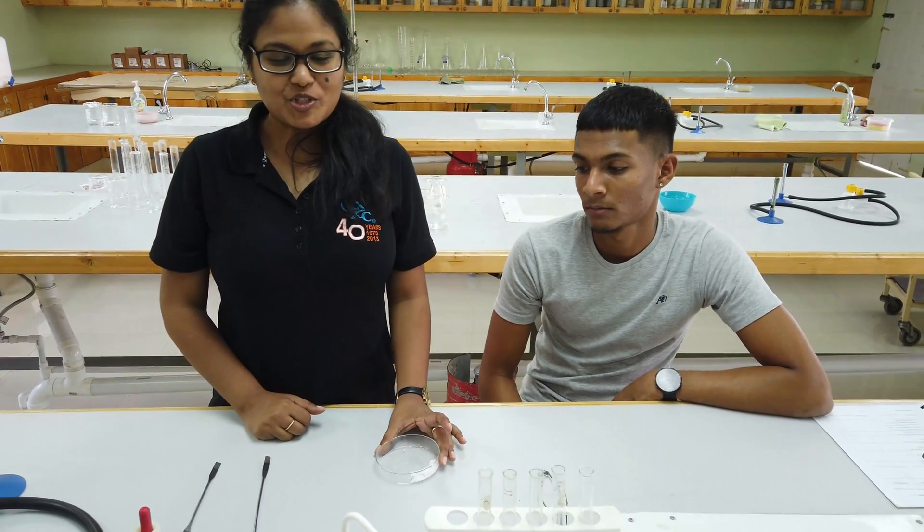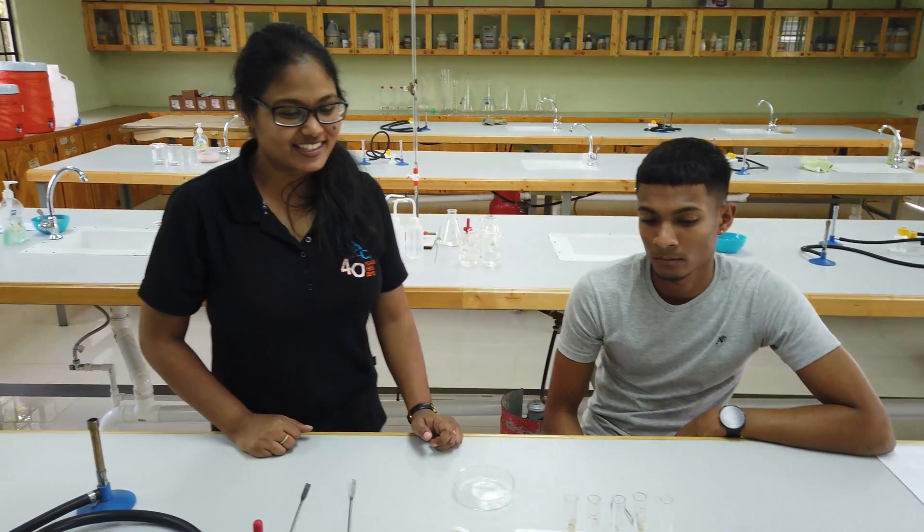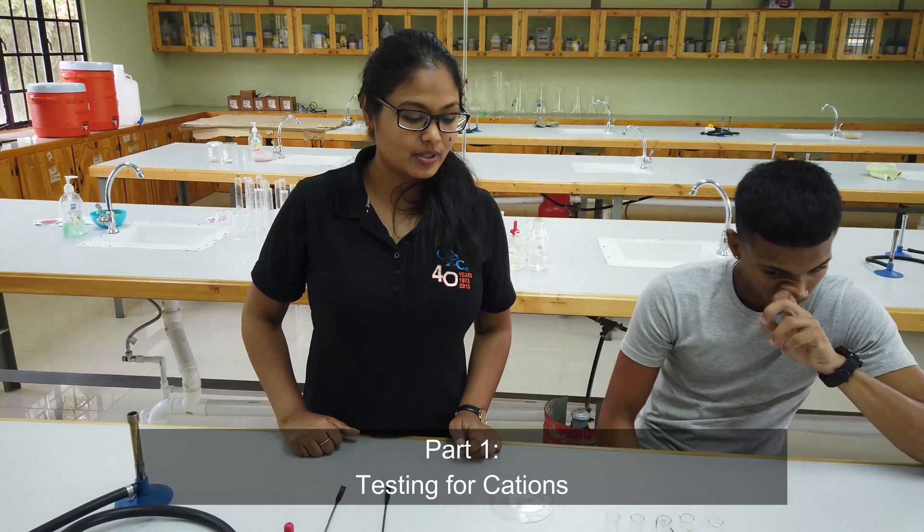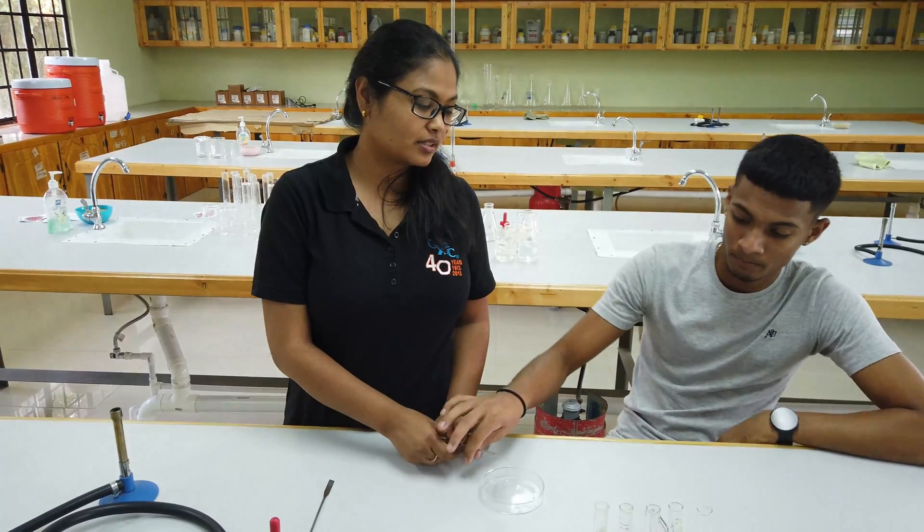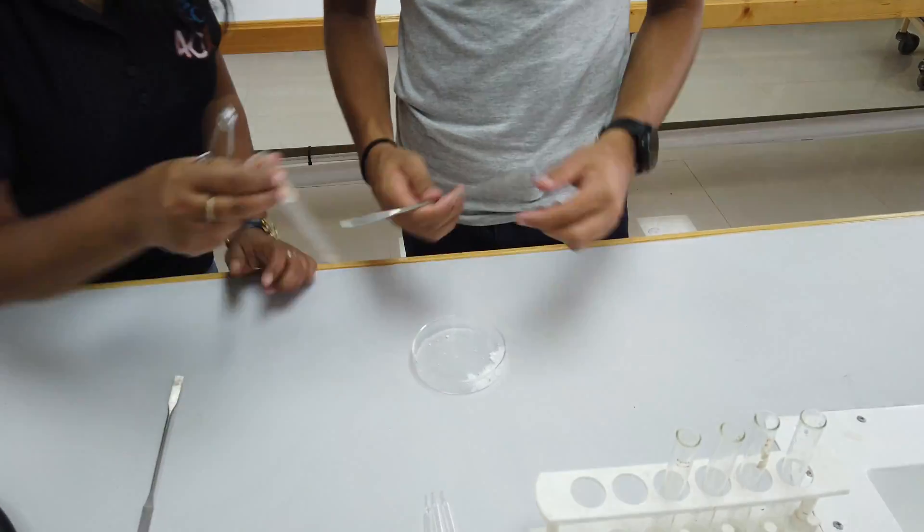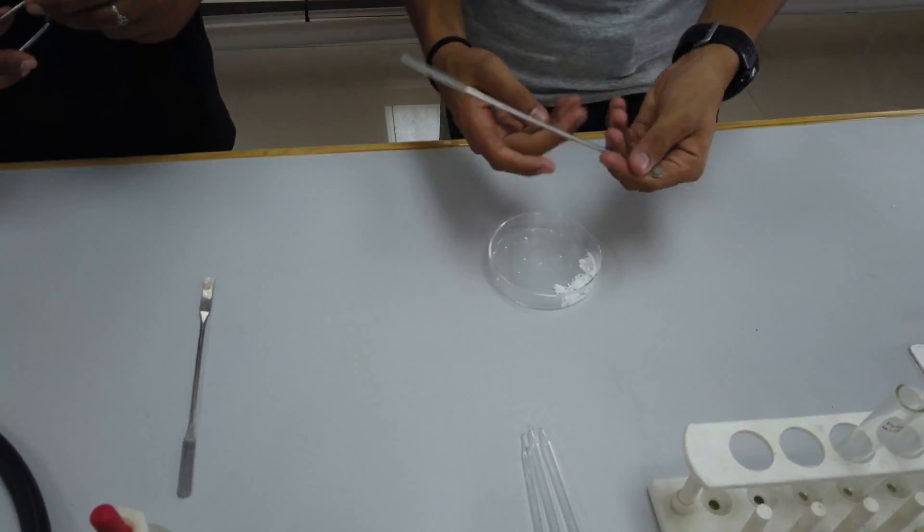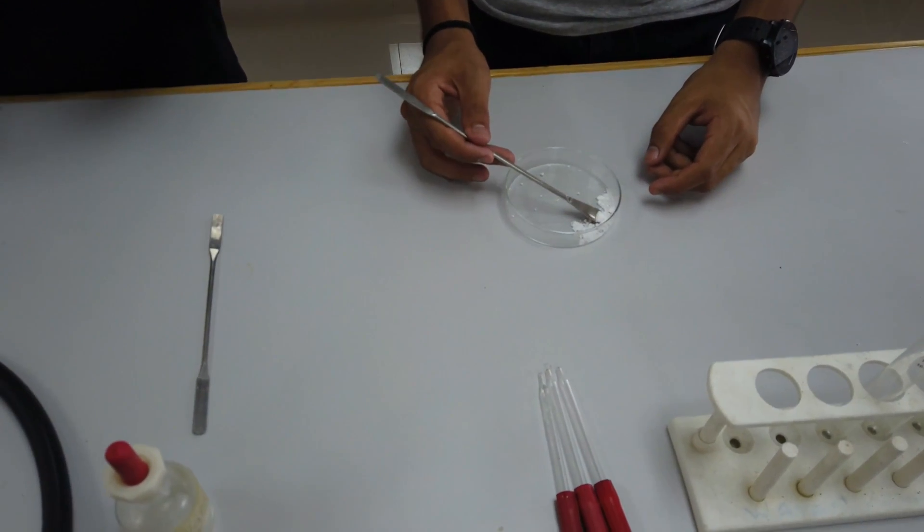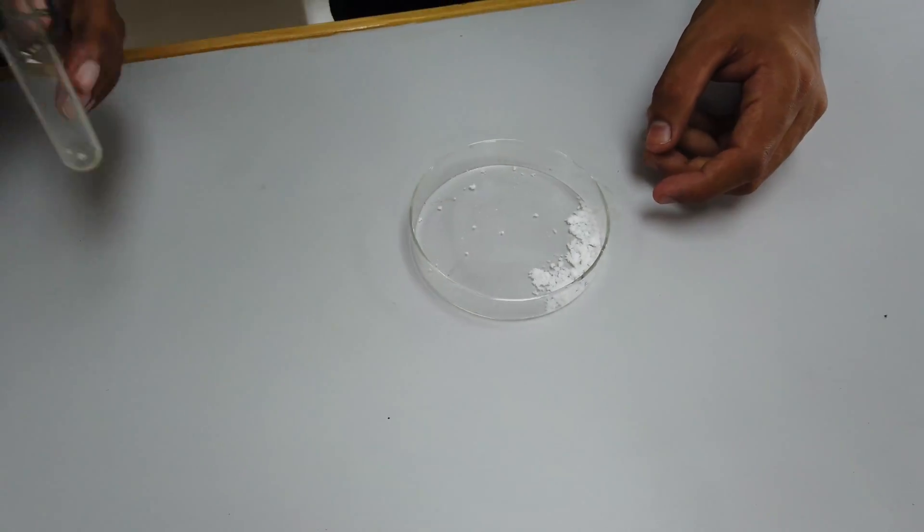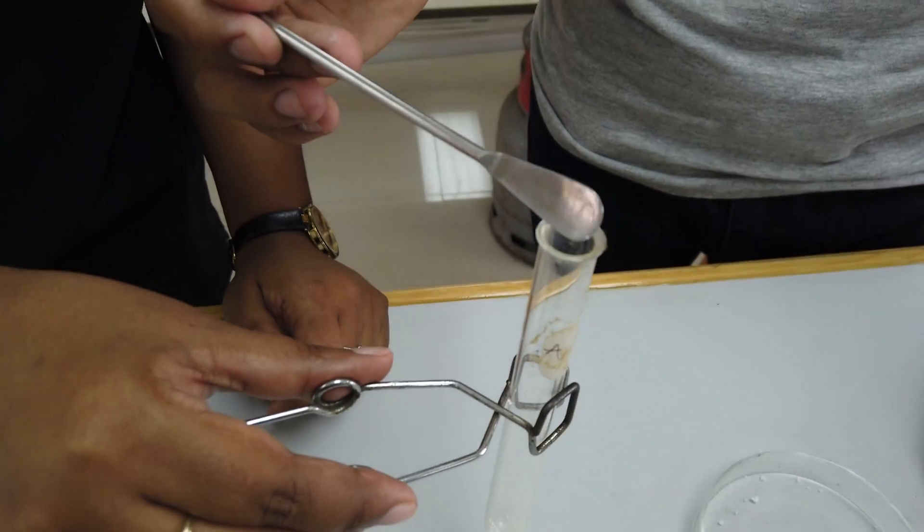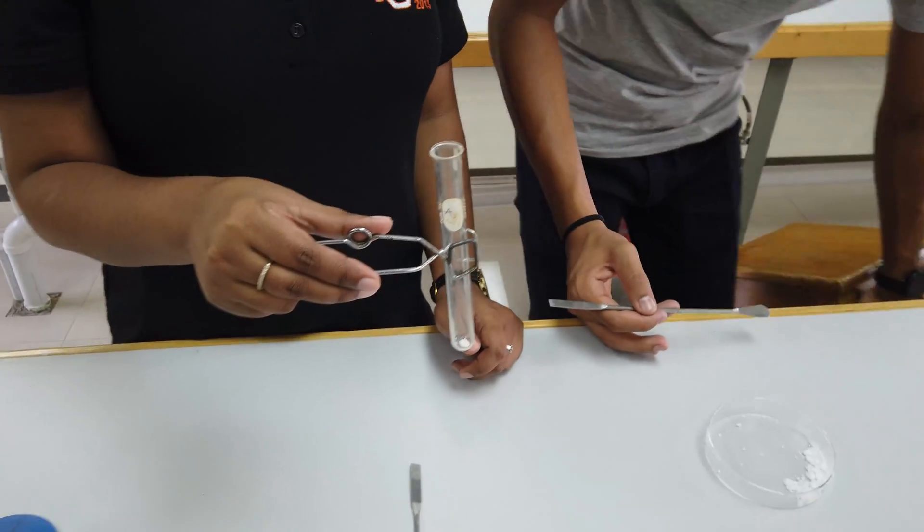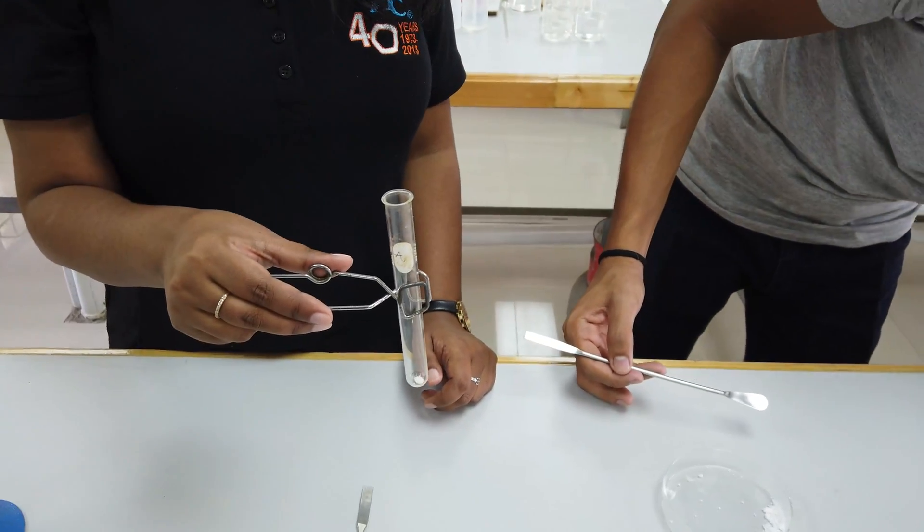The first thing we're going to look for is the cation. To determine what the cation is, we're going to take just a tiny, tiny little bit of salt - even less, just tiny.